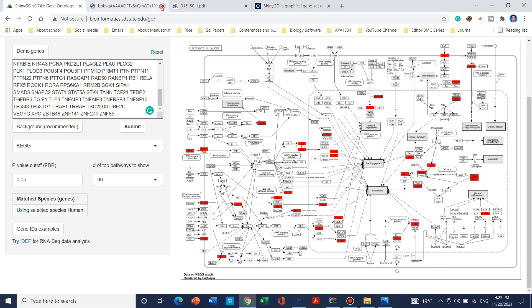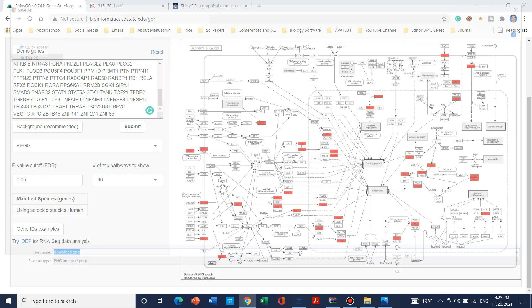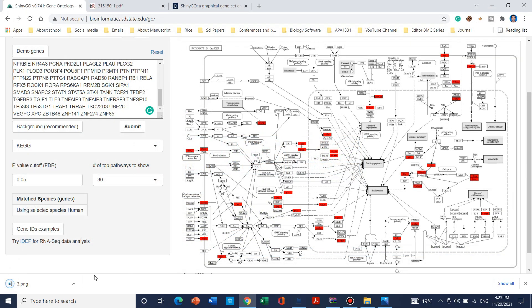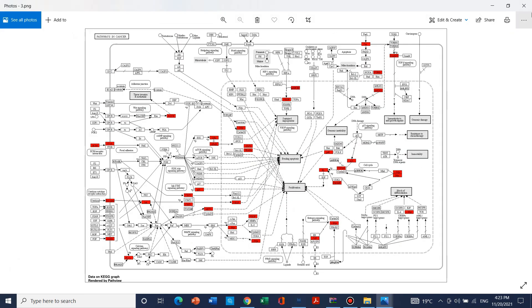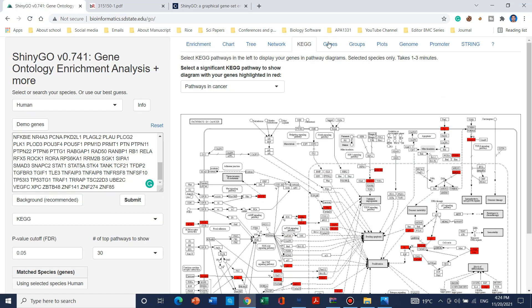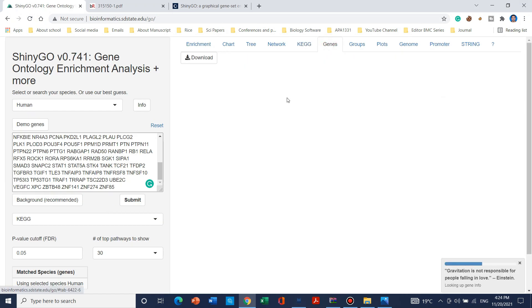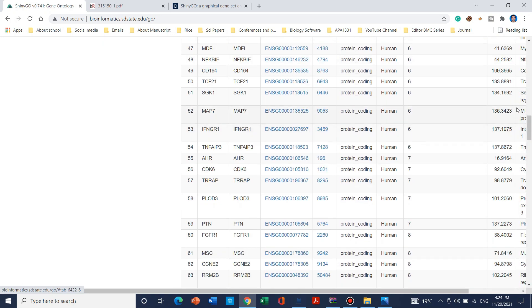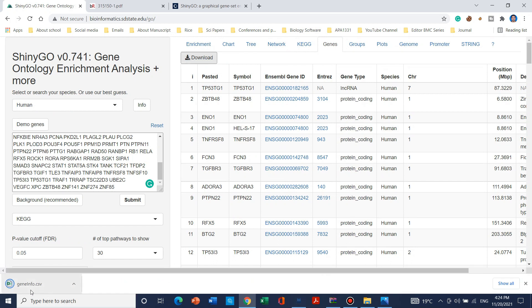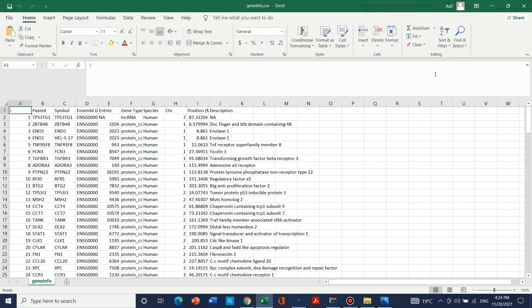The pathway figure is now downloaded. Moving to the next feature, the list of genes can also be downloaded in the form of a table. Simply click the download button and a table form of the genes will be downloaded, which you can use later for your own analysis.